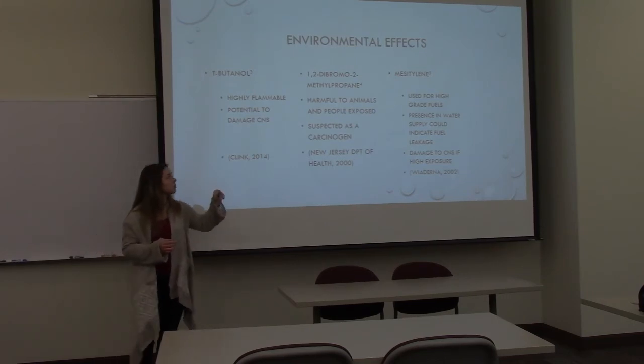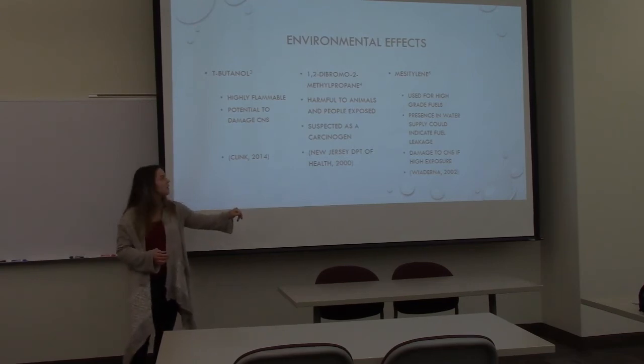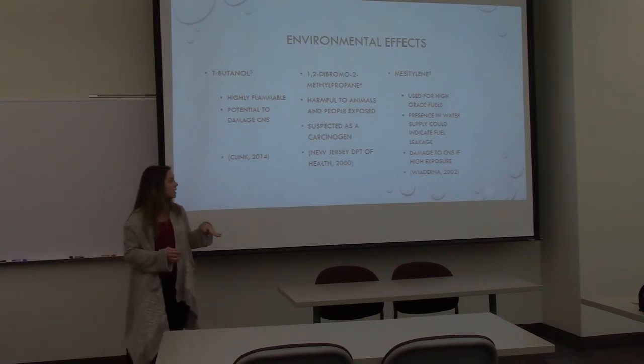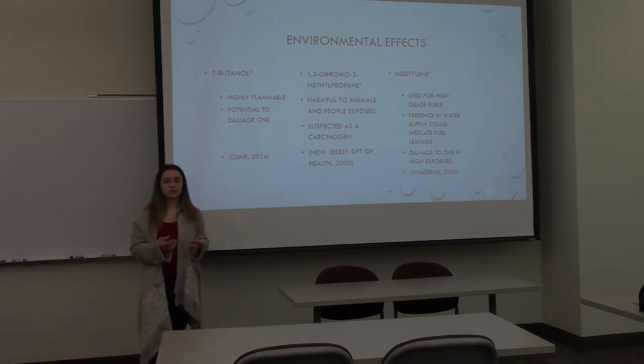And then 1,2-dibromo-2-methylpropane, according to the New Jersey Department of Health, is harmful to animals and people if they're exposed, and it could be suspected as a carcinogen. So if you are exposed to it for long enough, it can lead to diseases like cancer and so forth.